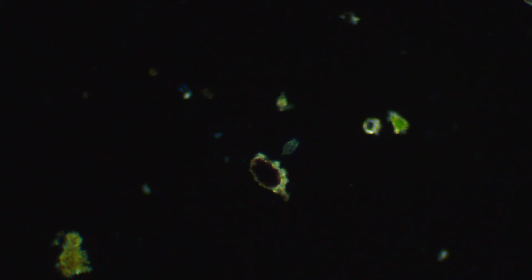Anyway, yeah, I know. I've been sticking on him for a while because he's just really cool to me. He's way cooler than those worms. Much cooler than worms is the little rotifer. Catching things, sucking up the water. You can see as the particles get closer to him, they move faster, and then he either catches them or they miss. I don't know if that's this little guy. Oh, yeah, that's too big. You can't eat that. You're a little guy. You need to get bigger before you can eat something that size.